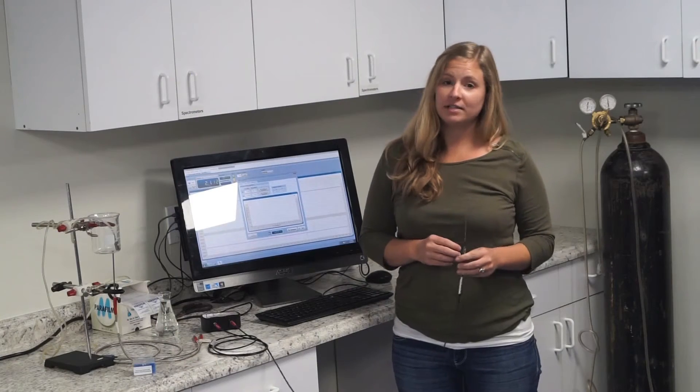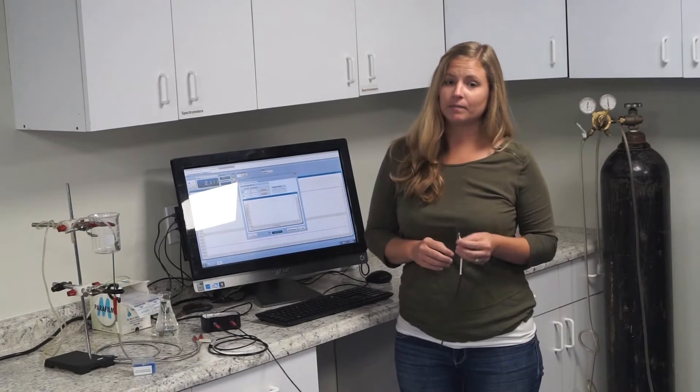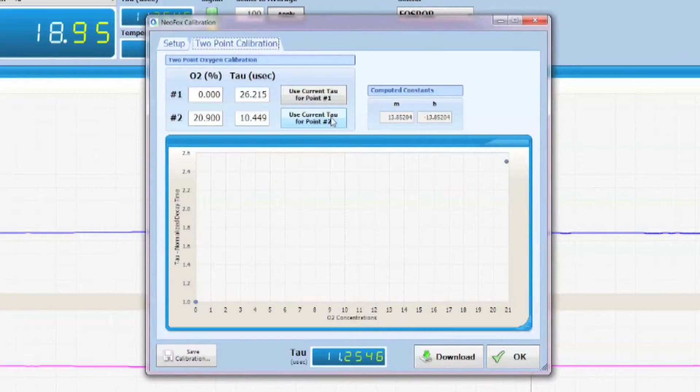Your first point is your easiest point to take, the ambient point. All you're going to do is click on the button that says use current tau for point number two.